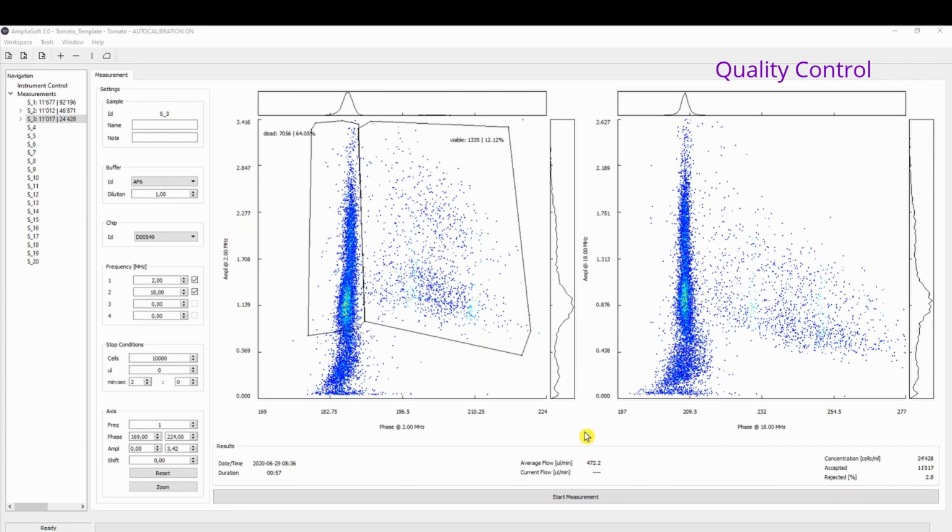Separation between dead and living populations. In an ideal case, the separation of living and dead cells can be seen on the first glance as two completely separated populations. The viable cells appear further right on the screen. The non-viable cells appear further to the left.